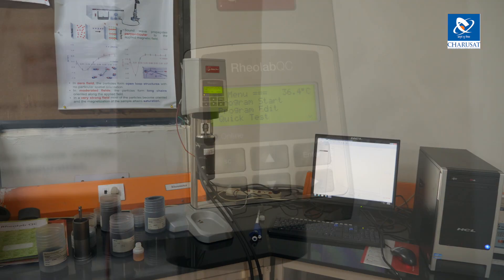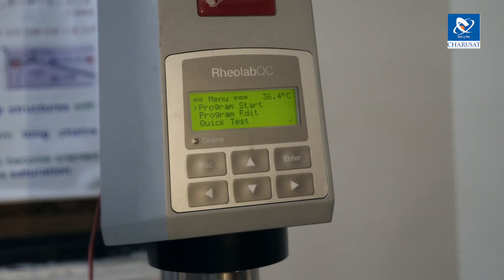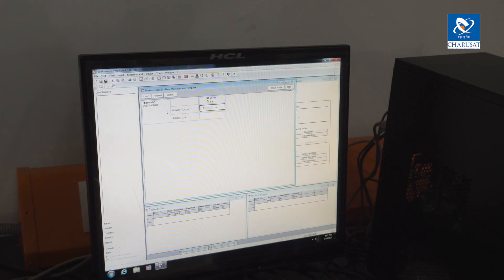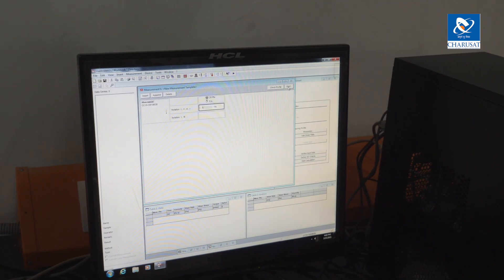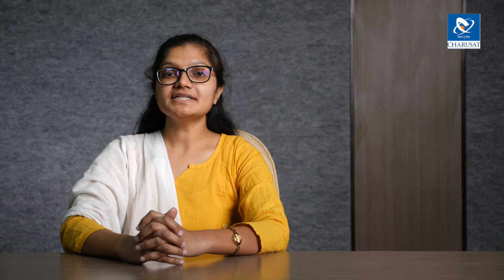We have a rheometer — the Anton Paar RheoLab QC — in our lab. It is a rotational rheometer; it can measure rheological properties or flow properties of a material. Basically, dynamic viscosity can be measured under applied shear.